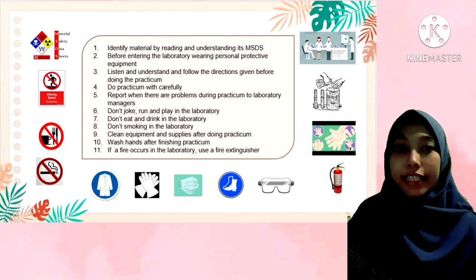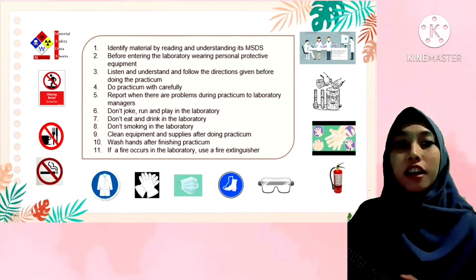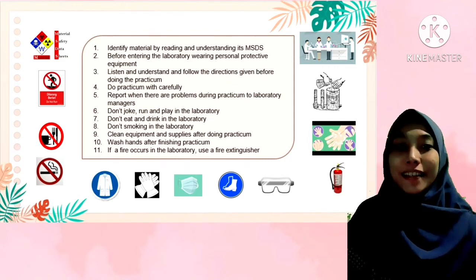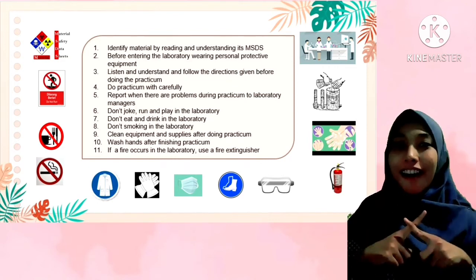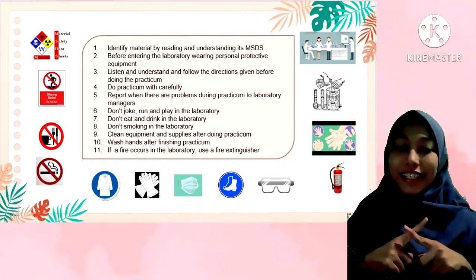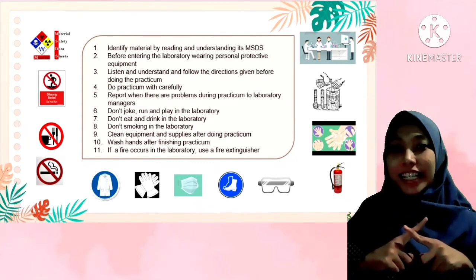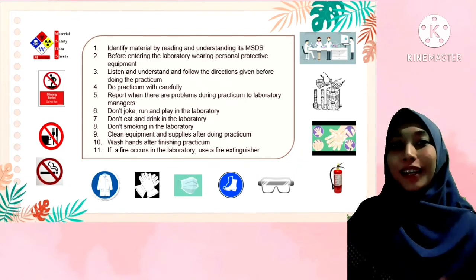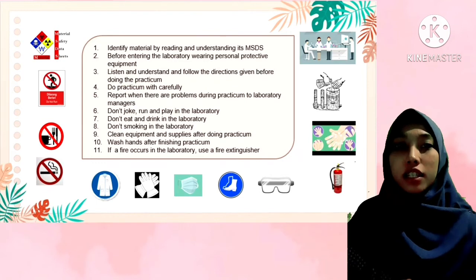Listen, understand, and follow the directions given before doing the practicum. Do the practicum carefully. Report problems to the laboratory manager when there are problems during the practicum. Don't joke, run, or play in the laboratory. Don't eat or drink in the laboratory. Don't smoke in the laboratory because there are many materials that react easily with fire.